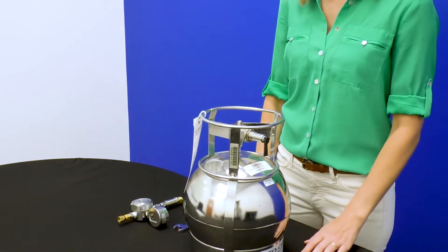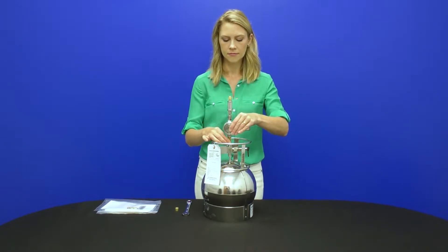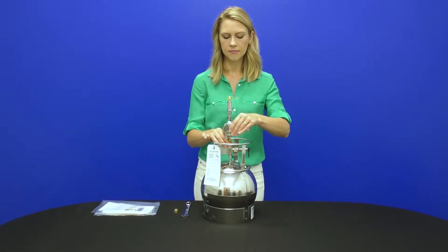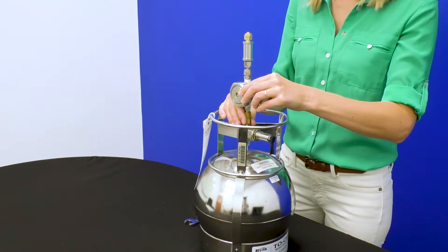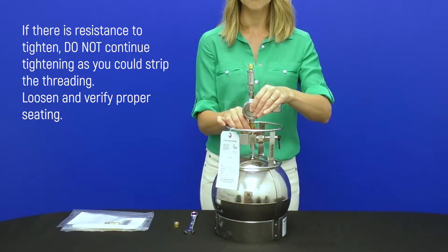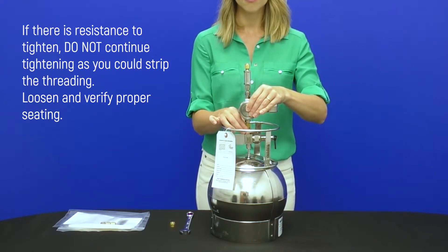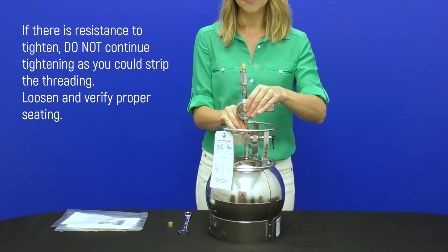Using your hands, attach the regulator to the canister, finger tightening the nut onto the canister. You should be able to thread the nut with minimal resistance for multiple turns. If there is resistance to tighten from the start, do not continue tightening as you could strip the threading. Loosen and verify proper seating before proceeding to finger tighten.